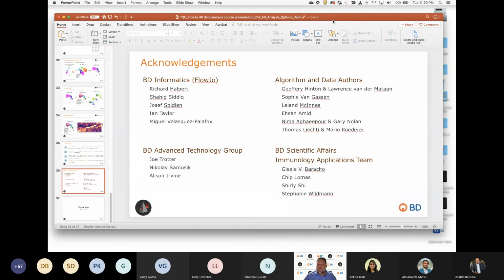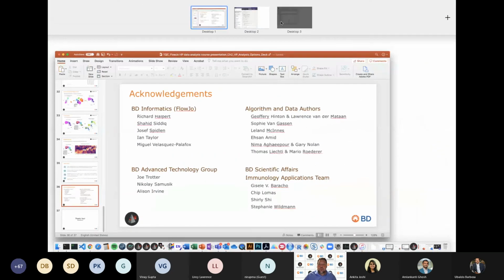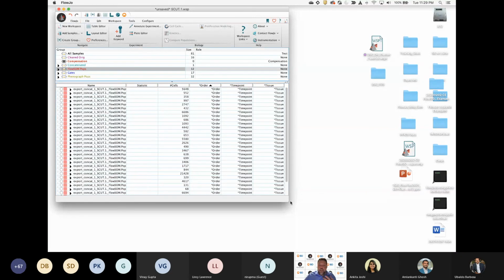I think we're actually out of time, of course, but I do want to hop over for 1 second and take a look at this experiment and just show you the way I go about this.